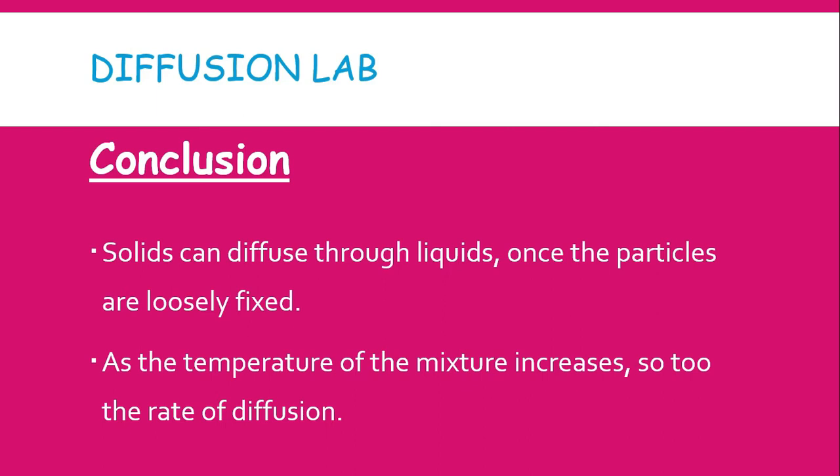Alright? Now, another thing we observe and can answer here is that as the temperature of the mixture increases, so too the rate of diffusion. So you'll remember that we said that diffusion is, of course, impacted or affected by temperature, and you would have seen that demonstrated in all three samples. Remember, you must follow the procedure when writing up the lab. Another important thing to note is that the discussion is something that would have been paid attention to when we are doing the IA lab. So you need to have a good discussion for your analysis and interpretation.